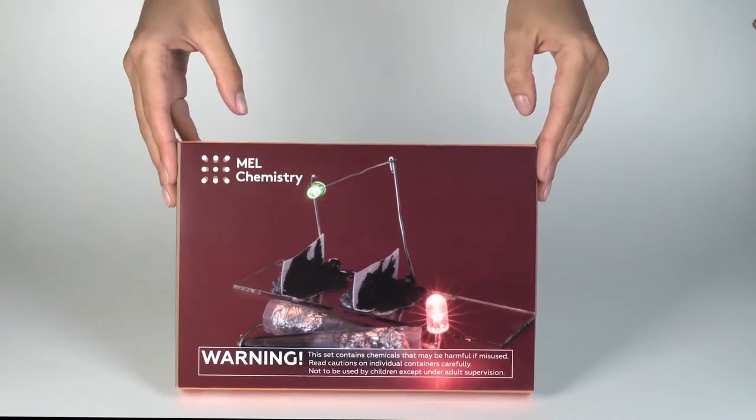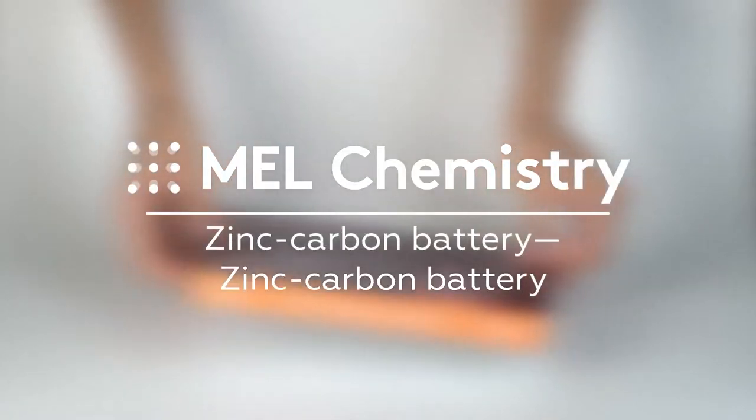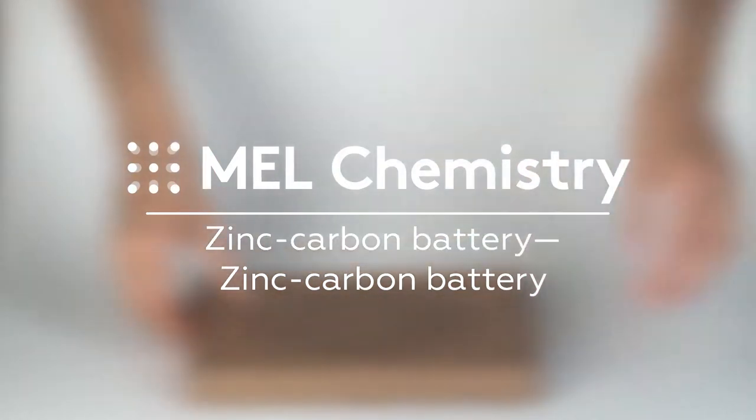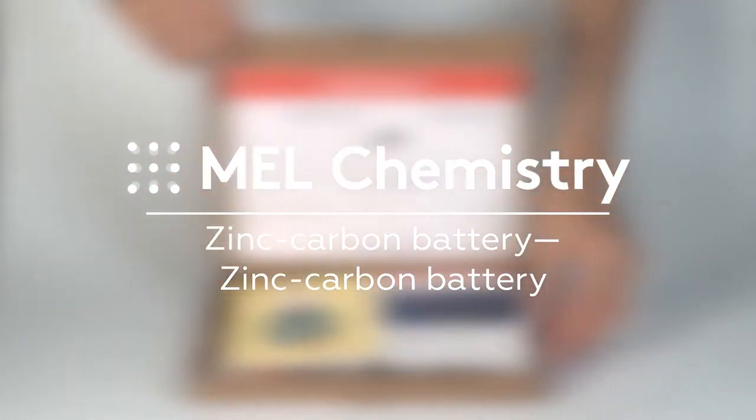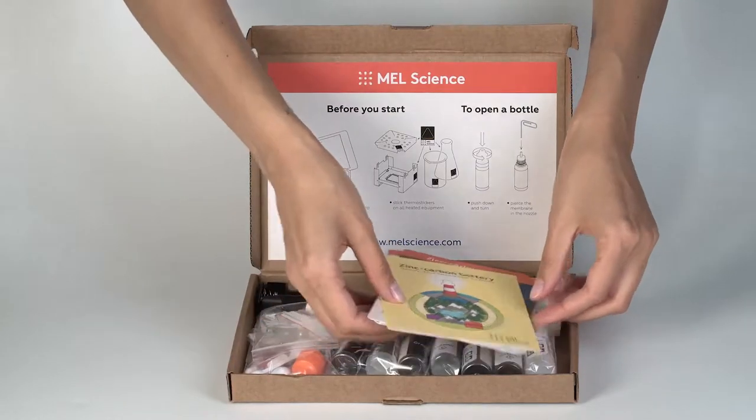Welcome to the wonderful world of chemistry. Today, with the help of the Zinc Carbon Battery Experiment from MEL Chemistry, we will assemble a battery on our own which will make an LED glow.